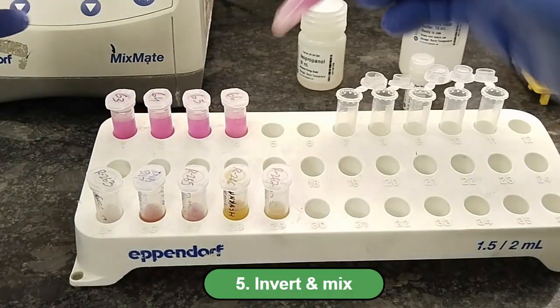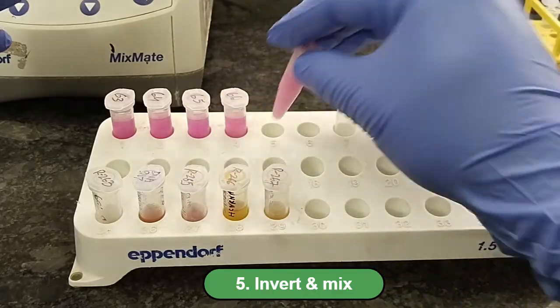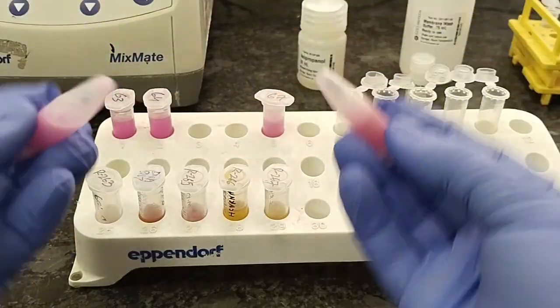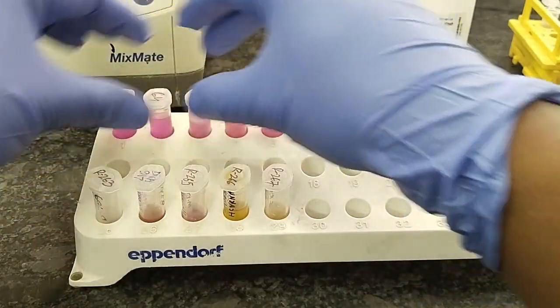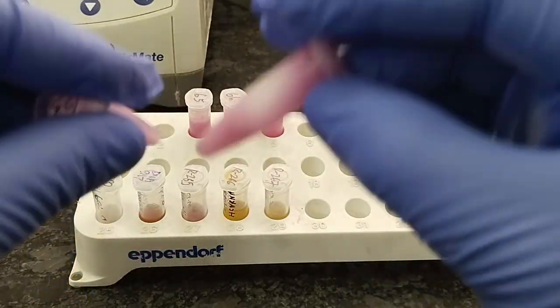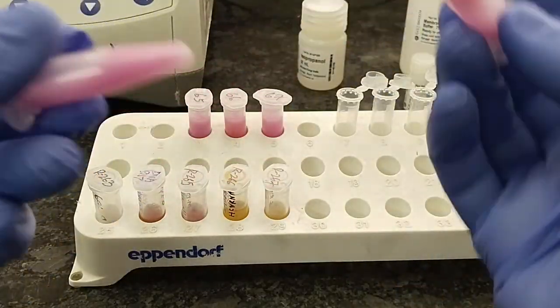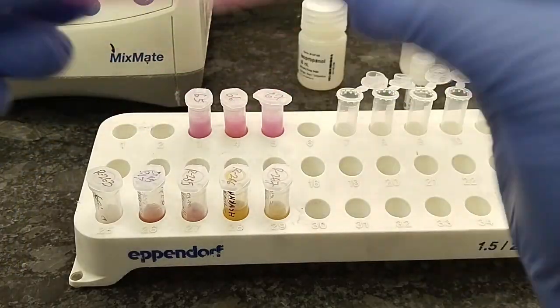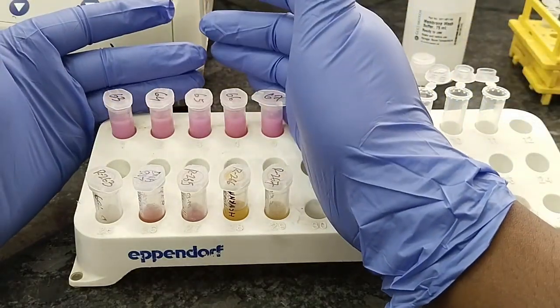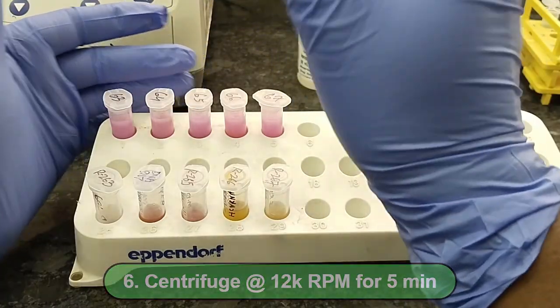Now invert the tube 5 to 10 times. After mixing the tube, we need to centrifuge at 12,000 RPM. So mixing is done. Now these tubes are to be centrifuged at 12,000 RPM for 5 minutes.